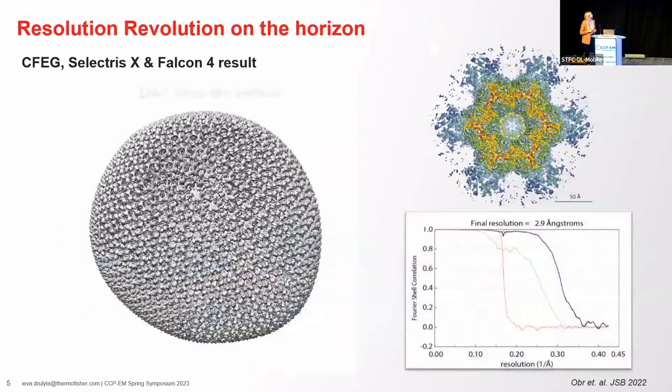The first example that I'd like to show is these equine infectious anemia virus-like particles. You can see that this particle is not very round. It has a different curvature in different areas. It lacks global symmetry. And if you look at multiple of these particles on the grid, all of them are slightly different, which means that they're not really suitable for single particle analysis.